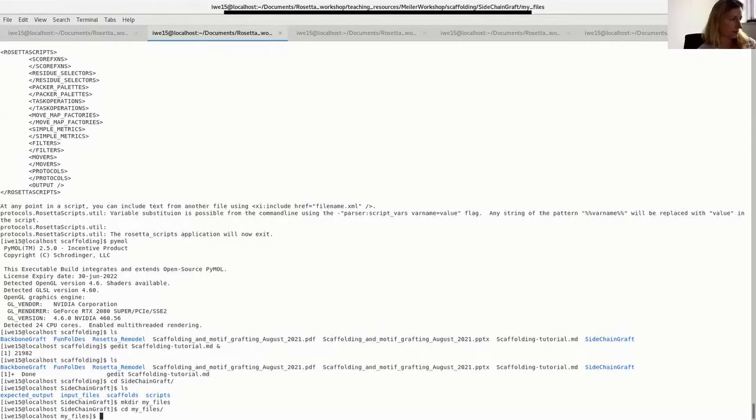In order to do so, I'm just going to use a script called clean PDB. It's provided inside Rosetta in the tools directory, and it's a really useful script that you can use to clean up your files and isolate chains from your PDB files. The protein we're going to be working on is the estrogen receptor bound with a little co-activator peptide.